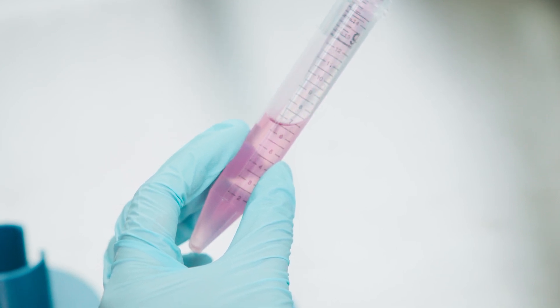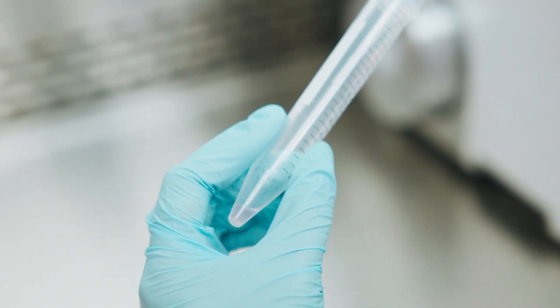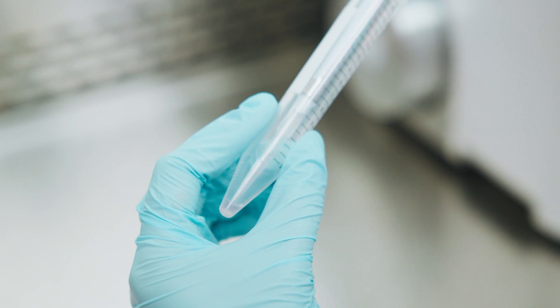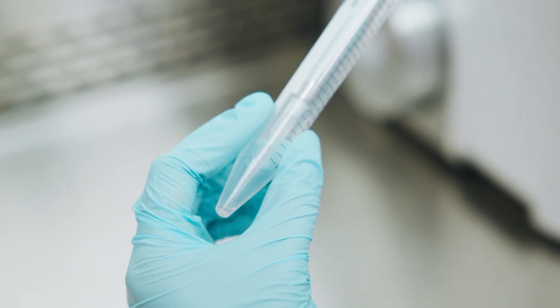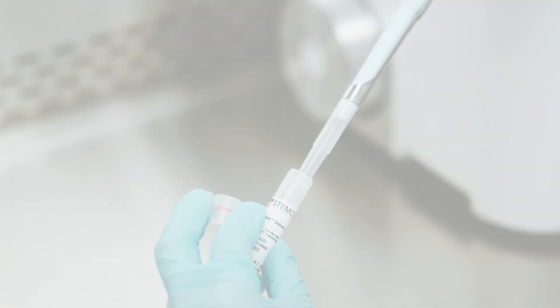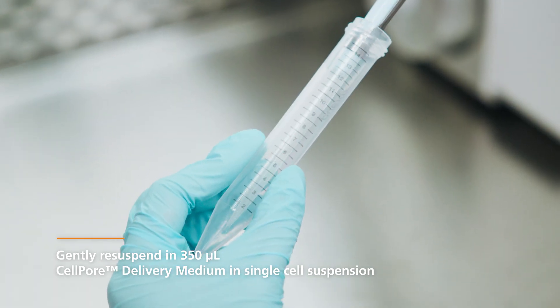Serological pipettes can first be used to remove the majority of the medium. However, it is recommended to use a small volume pipetter, such as a P200 or P1000, to collect the residual medium. Vacuum aspirators are not recommended at this stage, as this can lead to cell loss. Re-suspend the cell pellet in 350 µL CellPore delivery medium.